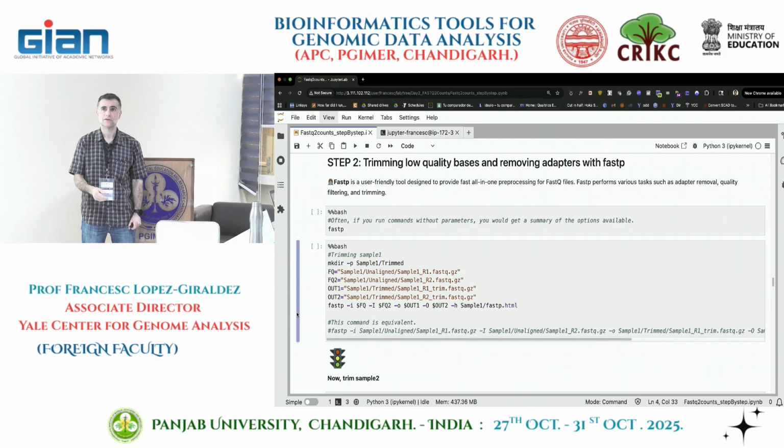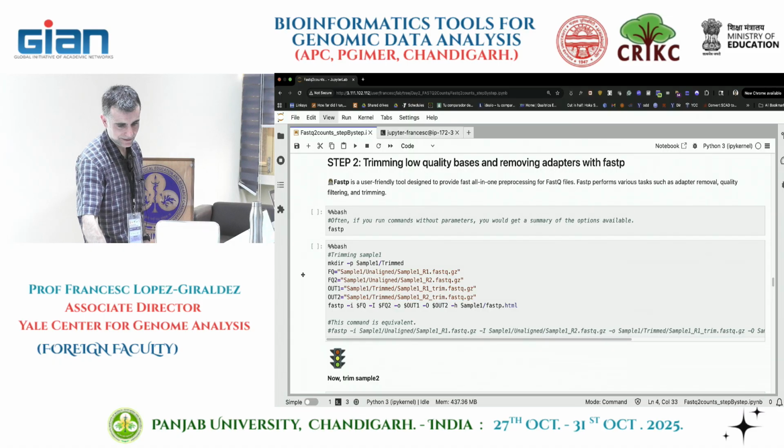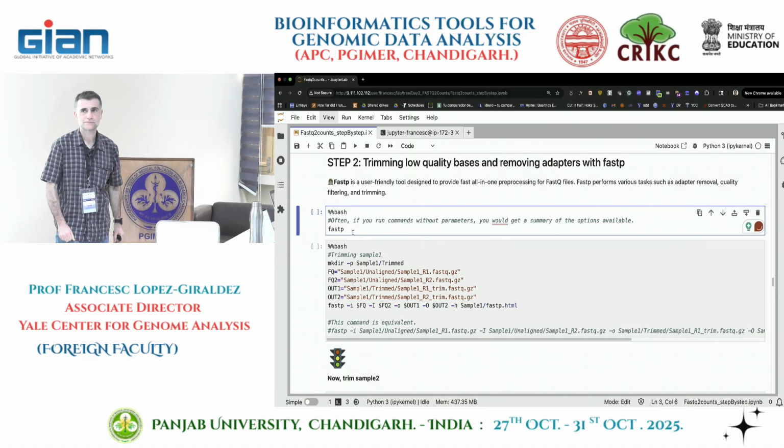It's actually based on the insert size. Assuming it's perfectly 150, then the index bases get added, 12 or 13 depending on the index base pair length. Suppose you have a 500 base pair insert. That means the first 150 base pairs from this end will be sequenced, and another 150 base pairs from the other end. If your insert size is say 250 base pairs, then the first 150 will be sequenced from here.